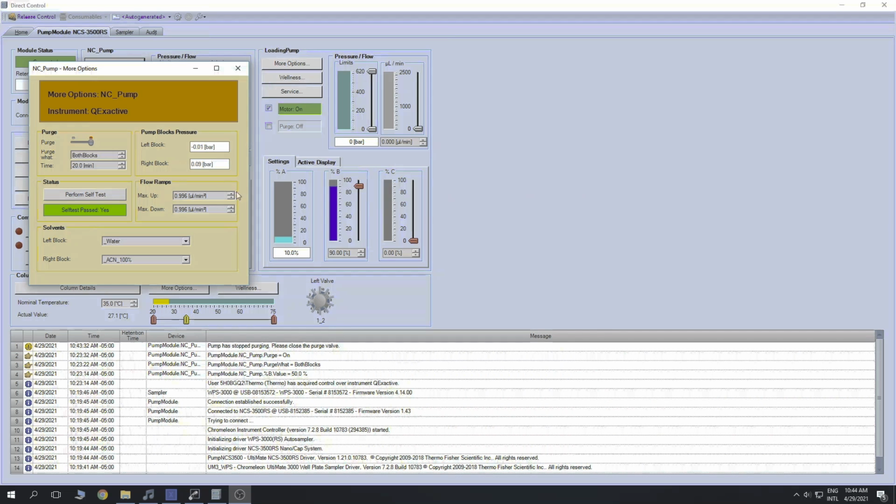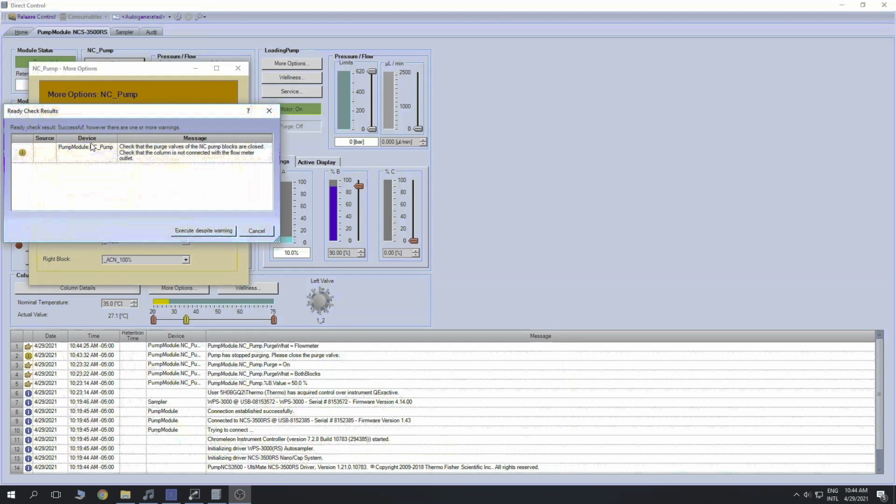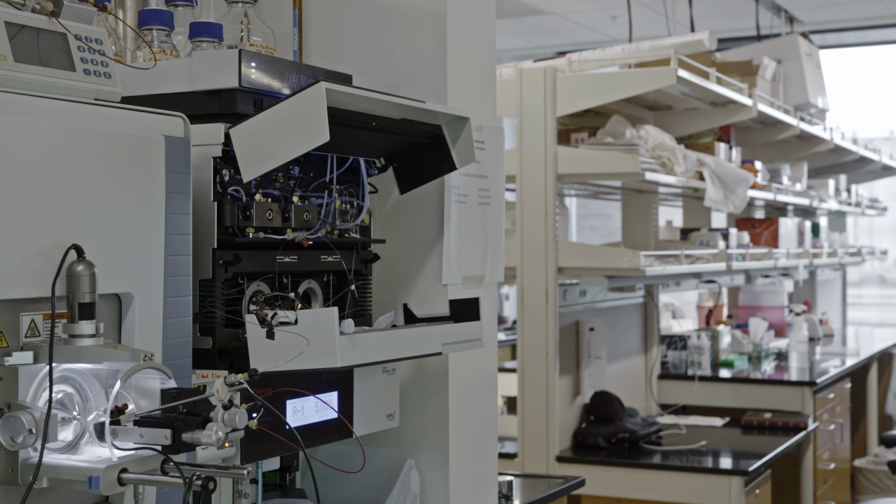So, in this same More Options window, we will select flow meter, and again, 20 minutes, and we'll turn the purge on. This time, the warning system that pops up will ask you to make sure that the purge valves have been closed again and that the column is not connected with the flow meter outlet. So that's where the stainless steel line is. If that's in there, the column's not connected, and so we're ready to start purging. And then come back in 20 minutes when the flow meter purge is concluded.